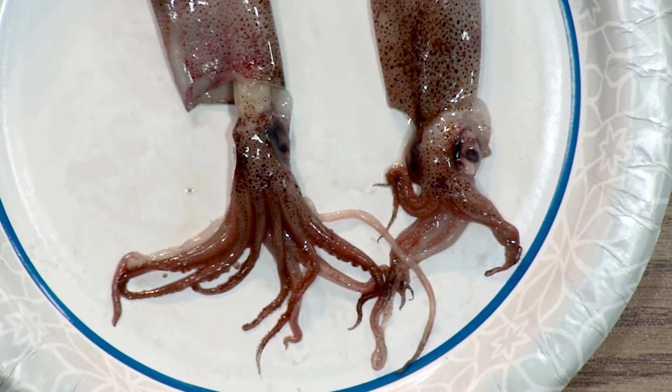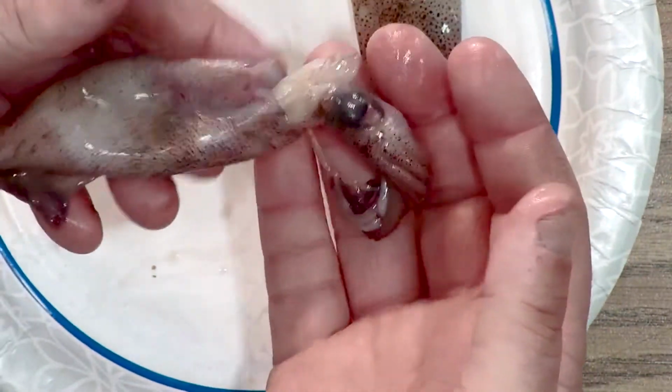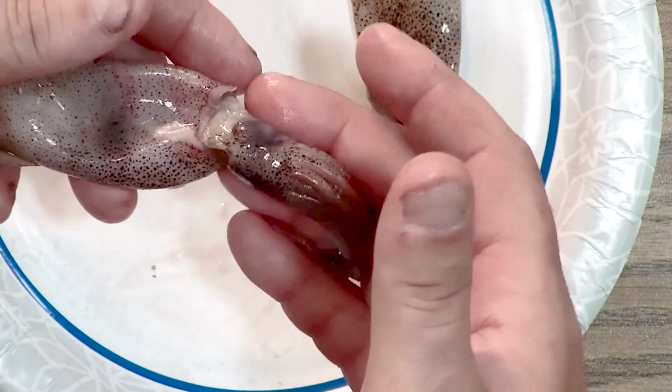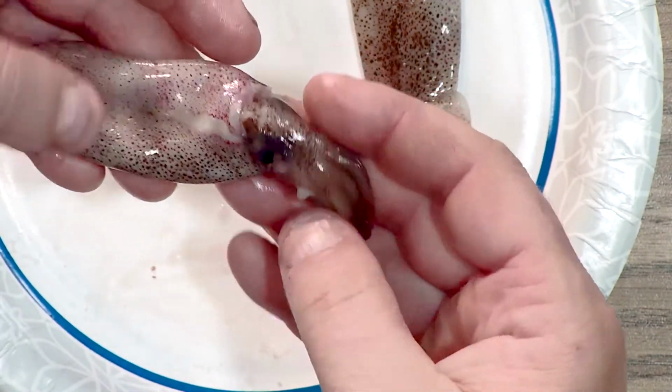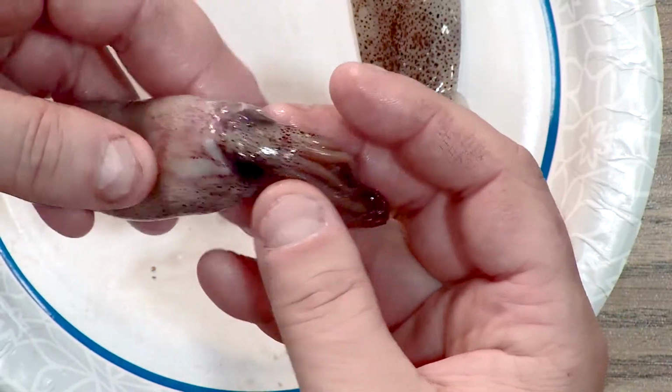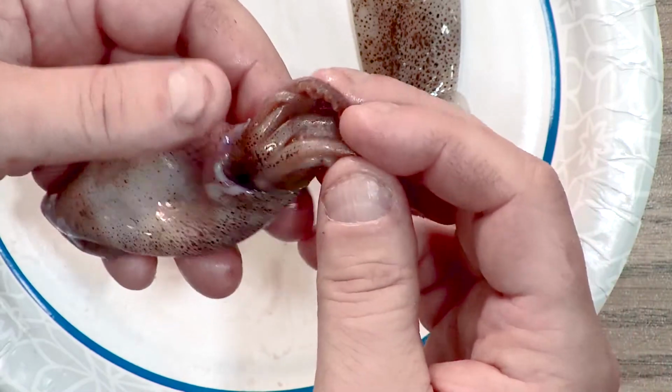And anytime you dissect something like this, the first thing you do is you kind of feel it and you're like, oh, this is gross. It's slimy. It's touching me. But you just kind of got to get comfortable. And I'm going to get comfortable with this, feel around in my hands without being too rough, because I don't want to damage any of the stuff on the inside.